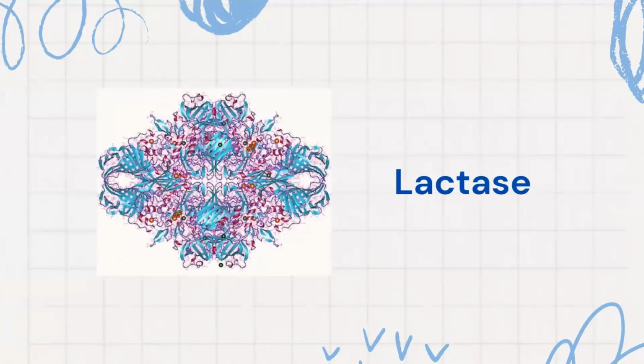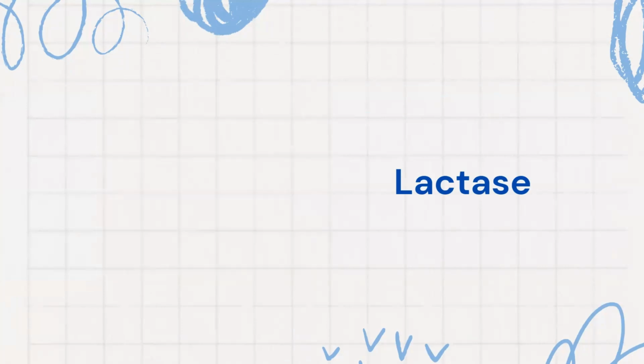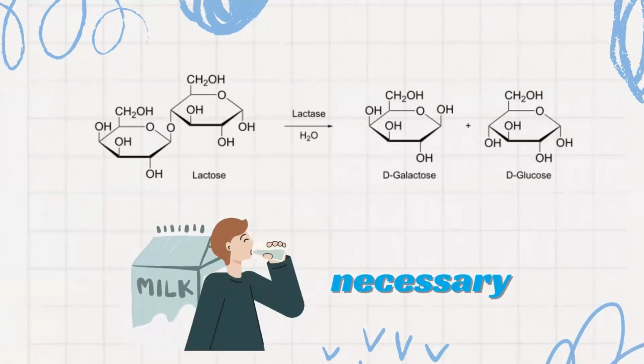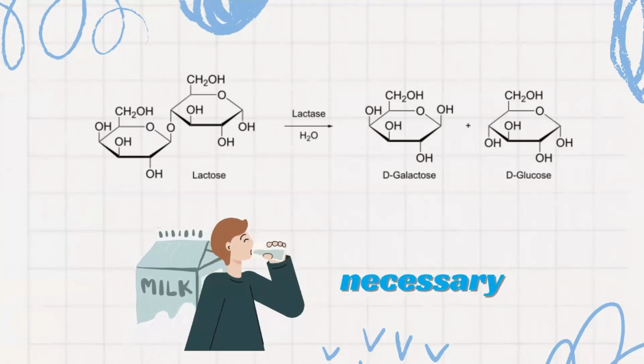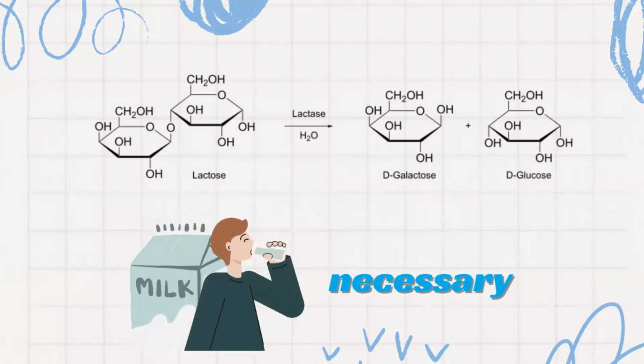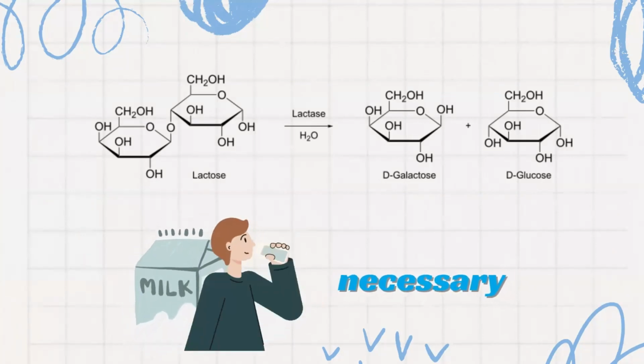In this experiment, lactase was selected as one of the experimental materials, which is a very common enzyme with highly conserved activity in the evolutionary process. Lactase catalyzes the hydrolysis of beta-glycosidic bonds in the disaccharide lactose, releasing galactose and glucose. It's important for humans to digest milk.